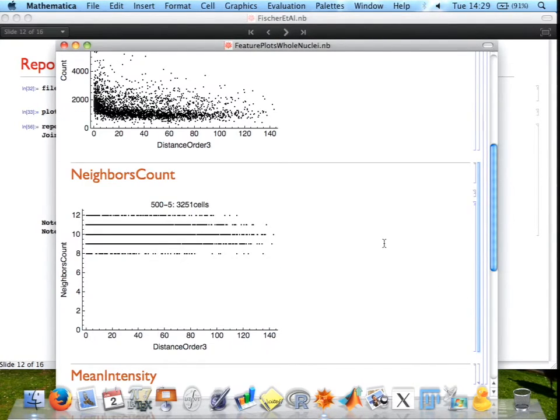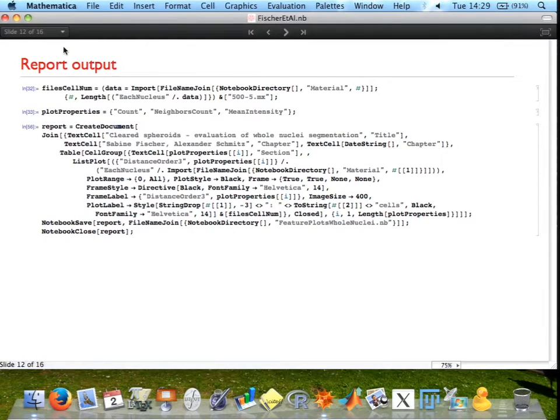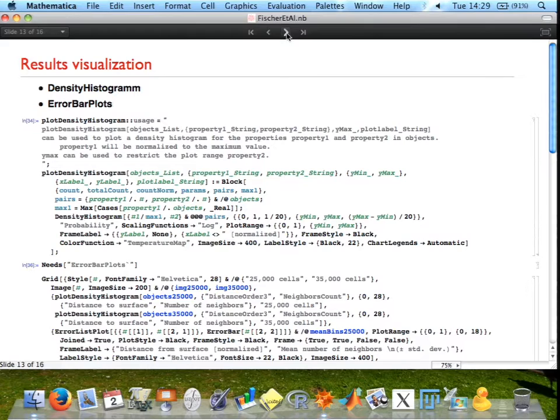And this is without formatting. This is just the raw data, so that we can look at it and check which one has interesting features, which ones do we want to look at further. Is there anything that doesn't look like we would imagine it to? Then we'll have to go back to the images and see if something went wrong. So it's a result, but also to check whether everything was okay. And then out of these results, we can then choose the most interesting ones and plot them.